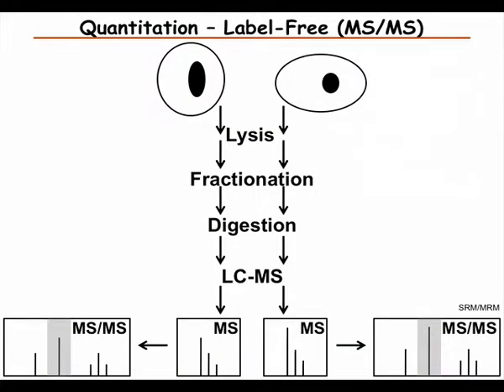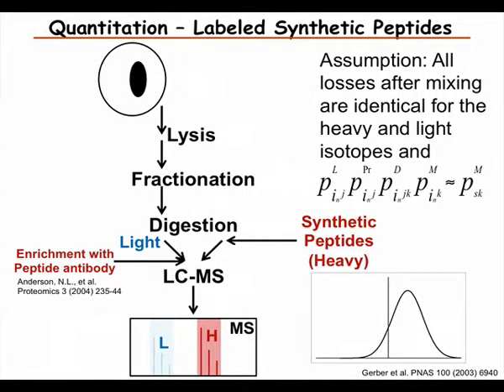It's easier to quantify over time too, right? Yes. And so for example, if you want to have a lot of samples, so it takes you months to measure them, having some kind of internal control will make it much easier to normalize over a long time.